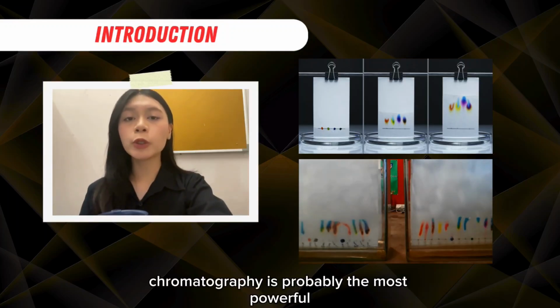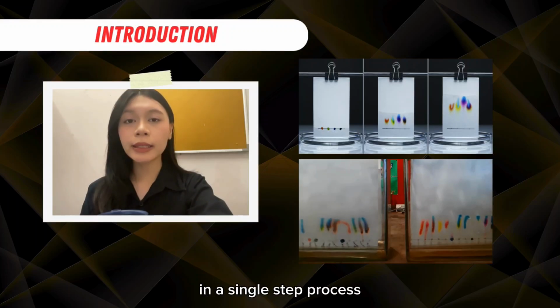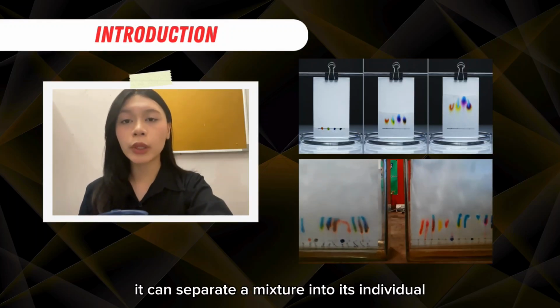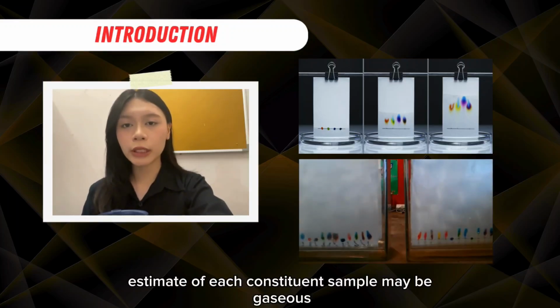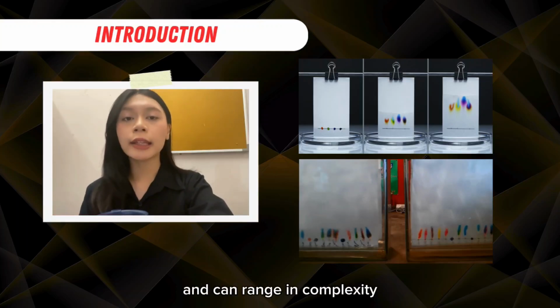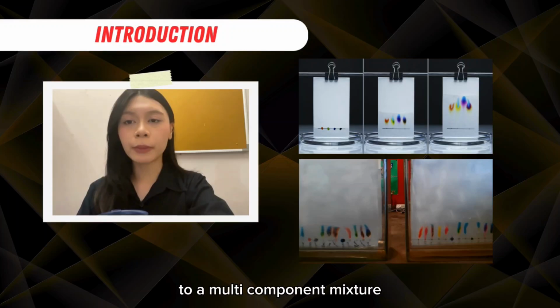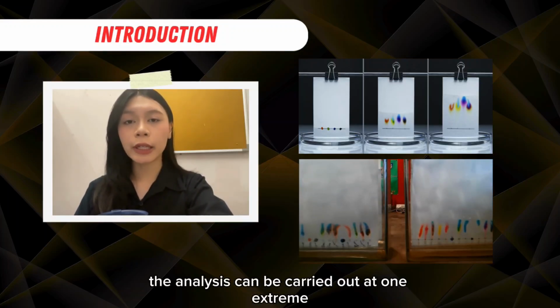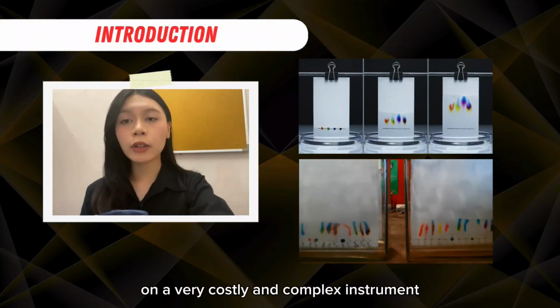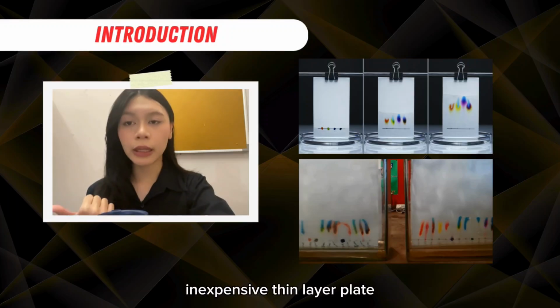Chromatography is probably the most powerful and versatile technique available to the modern analyst. In a single-step process, it can separate a mixture into its individual components and simultaneously provide a quantitative estimate of each constituent. Samples may be gaseous, liquid or solid in nature, and can range in complexity from a simple blend of two enantiomers to a multi-component mixture containing widely different chemical species. Furthermore, the analysis can be carried out at one extreme on a very costly and complex instrument, and at the other on the simple, inexpensive thin layer plate.